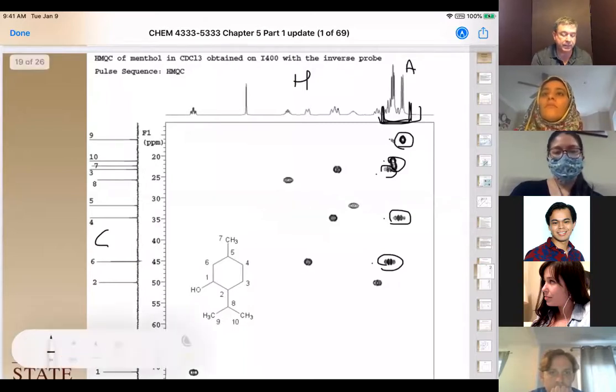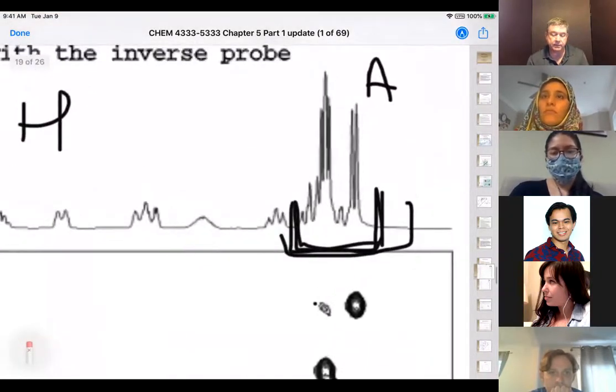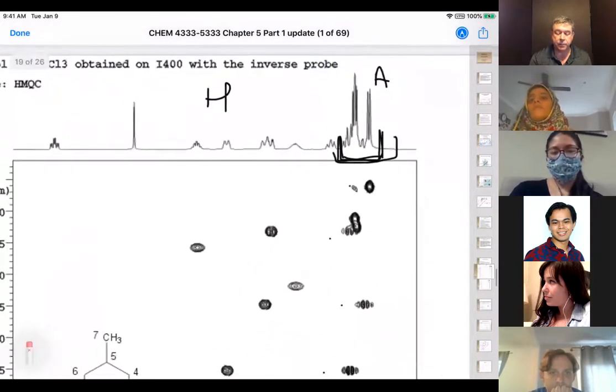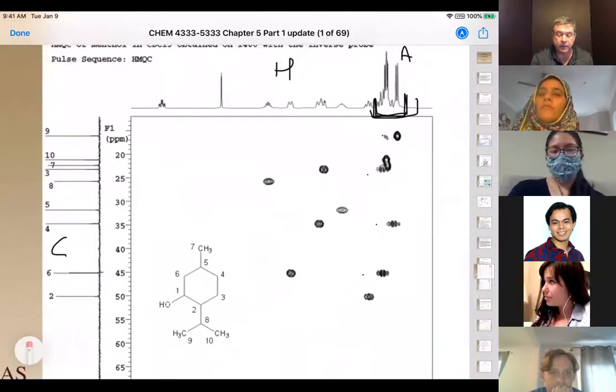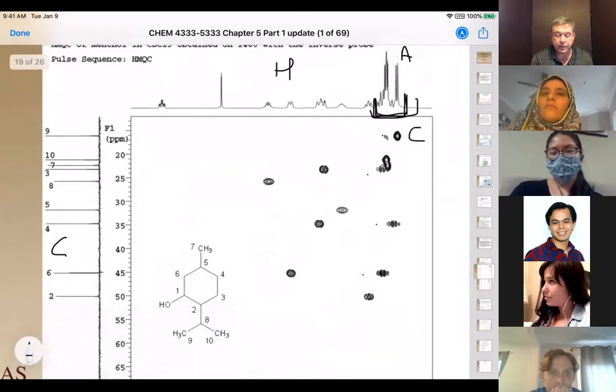we can't differentiate them just by proton NMR. We don't have baseline selectivity. We don't have a really good splitting pattern. And I bet if we looked at the integration, it would look very noisy. So we can't identify it just with the proton NMR. But we can say that carbon number 9 has A-type hydrogens, meaning that they are the lowest shift, so they're the most hydrocarbon-like.